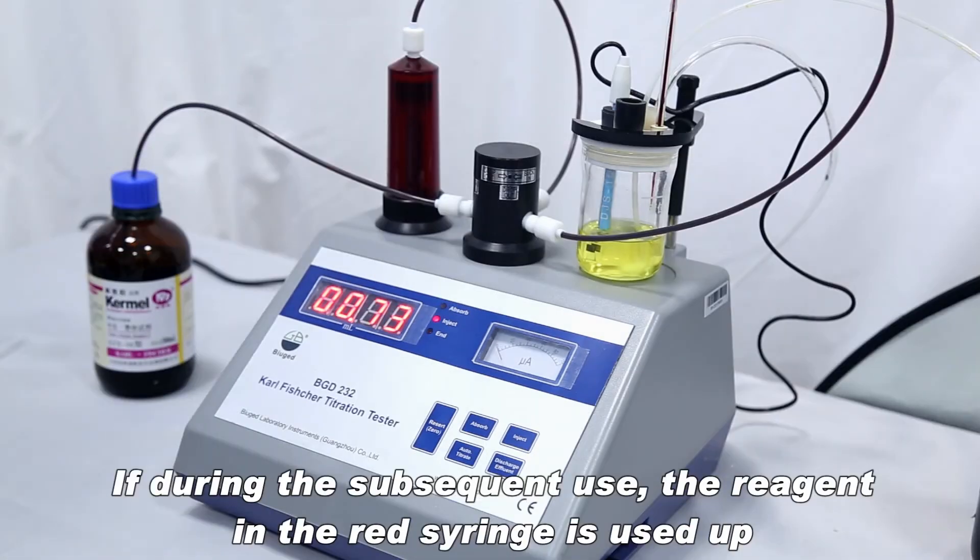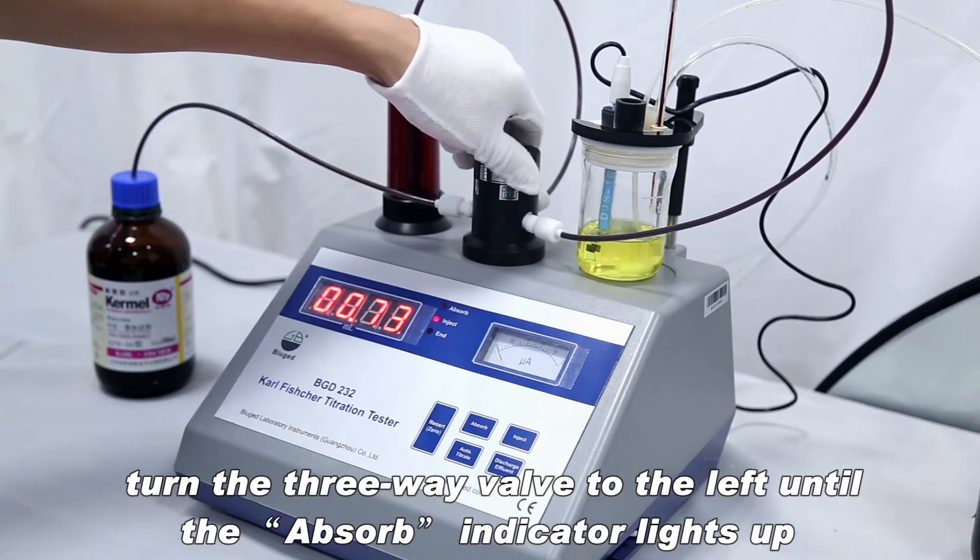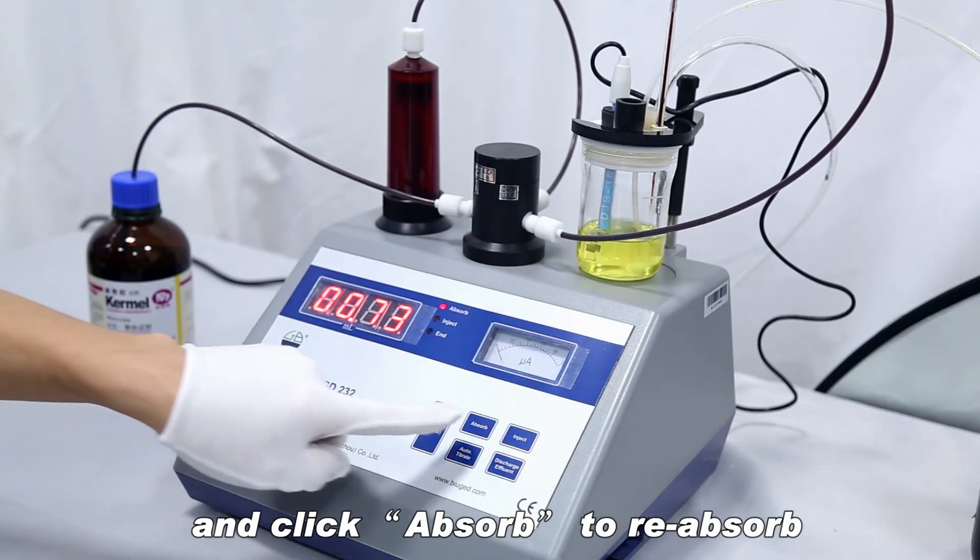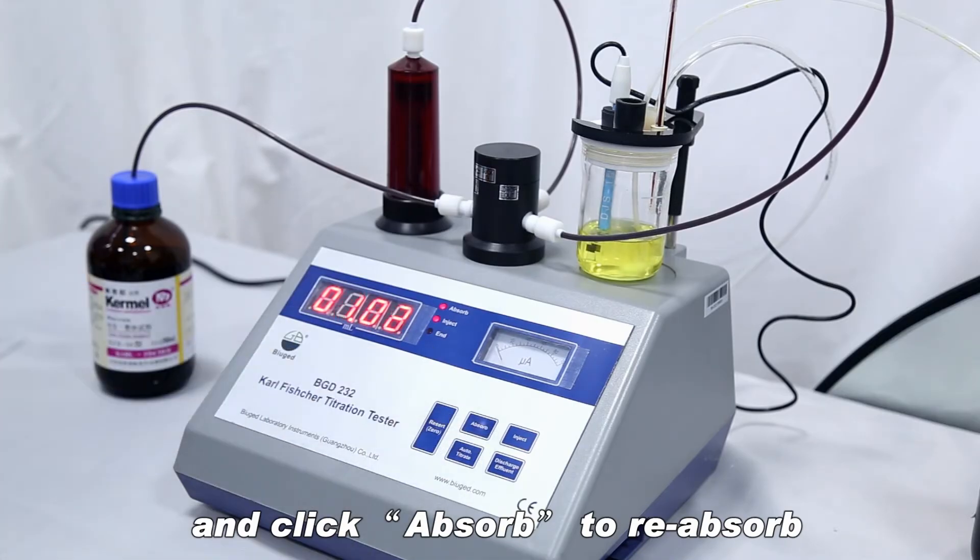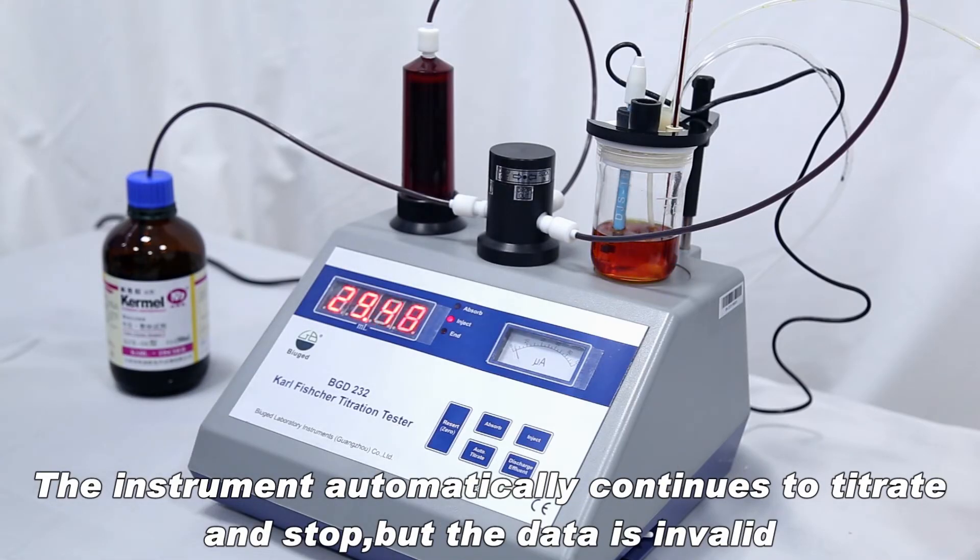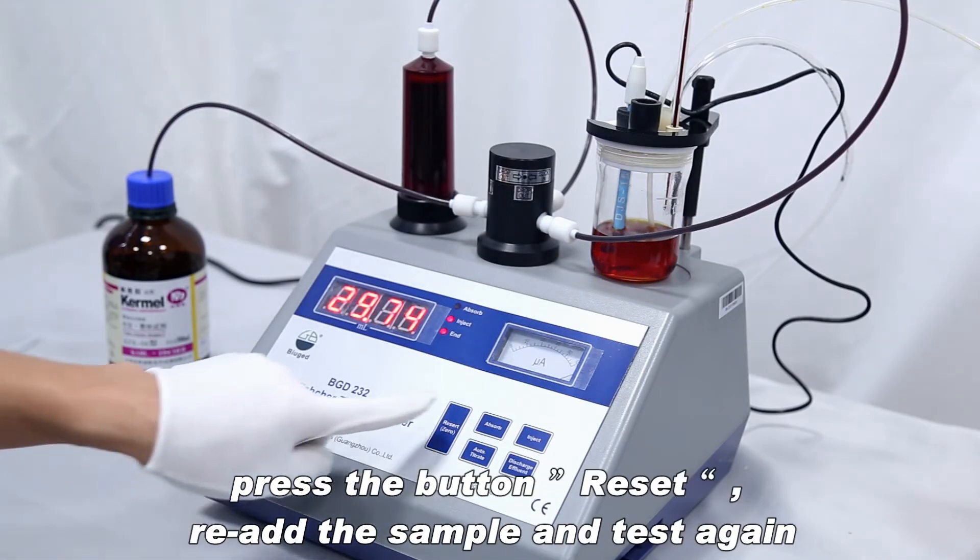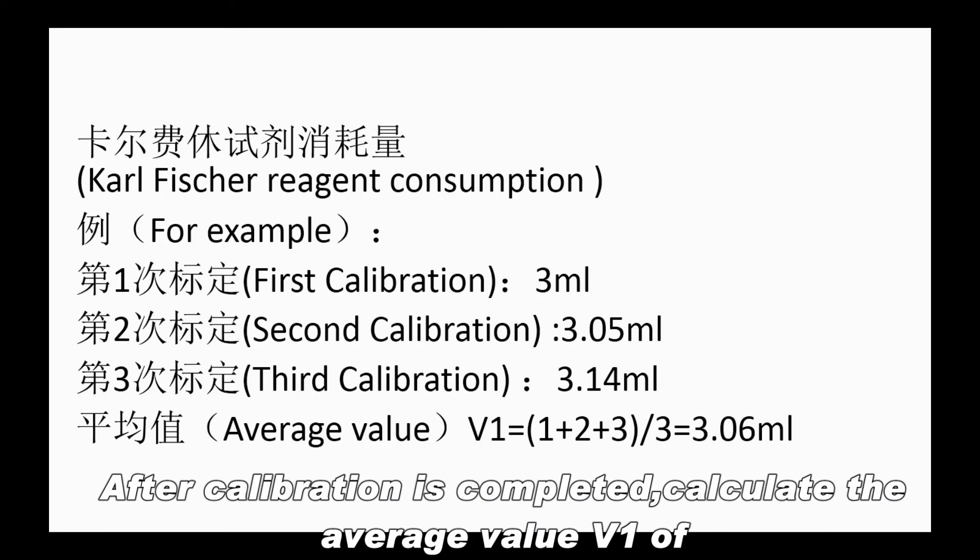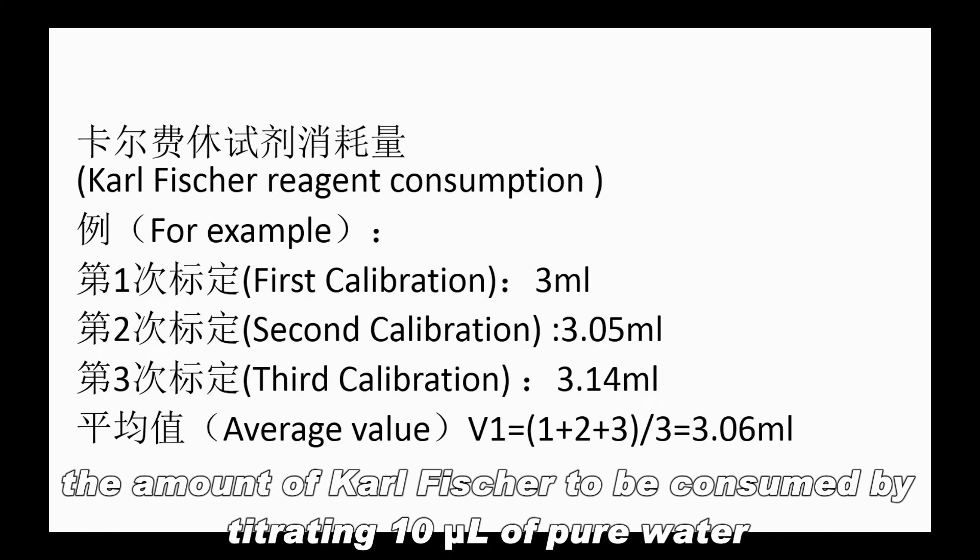If during subsequent use the reagent in the red syringe is used up, turn the 3-way valve to the left until the absorb indicator lights up and click absorb to reabsorb. Then rotate the 3-way valve to the right after filling. The instrument automatically continues to titrate and stop, but the data is invalid. Press the button reset, re-add the sample and test again. After calibration is completed, calculate the average value to be the amount of Karl Fischer to be consumed by titrating 10µL of pure water.